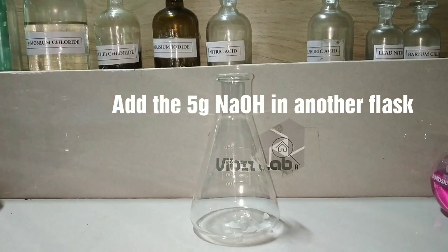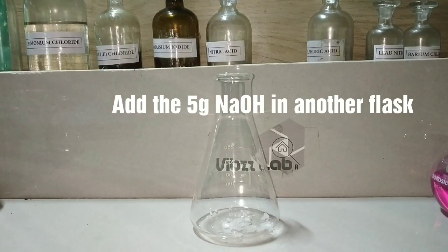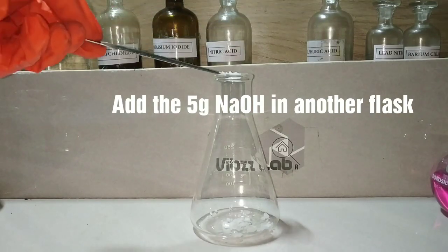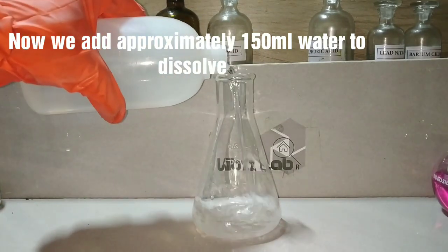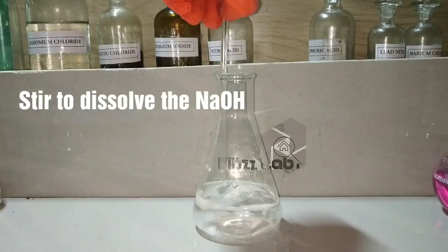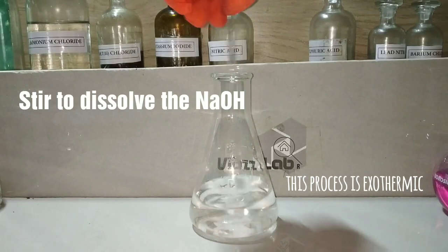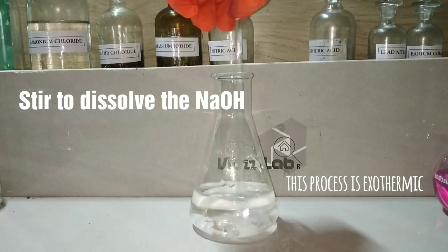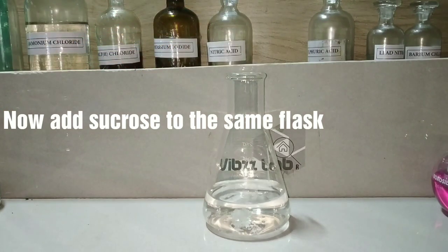Now we prepare a separate solution of 5 grams of sodium hydroxide and sucrose. We are now adding the sodium hydroxide into a flask, then adding distilled water and stirring to dissolve it. This process of dissolution of sodium hydroxide is exothermic. Now we add sucrose to the same flask.